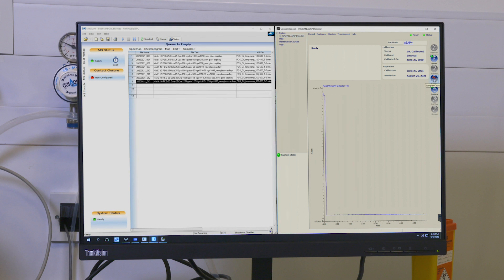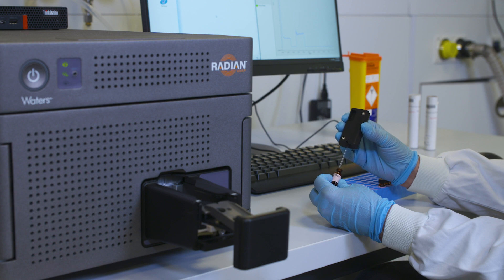An automated bake-out procedure removes any potential contamination that might be present prior to starting the analysis. Once clean, a simple dip and insert technique is all the analyst needs.